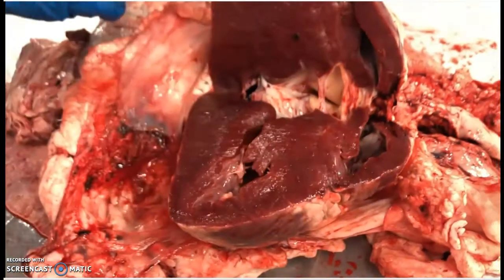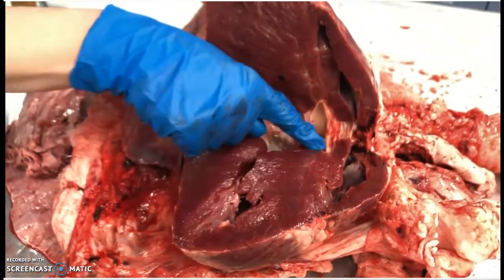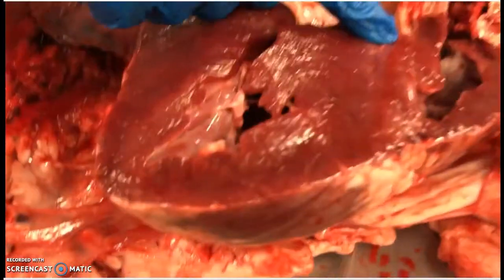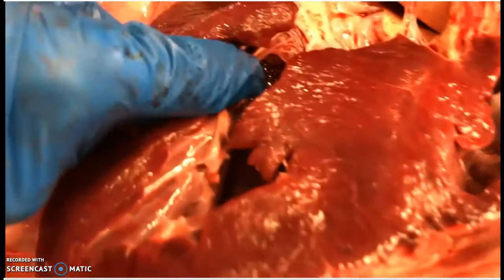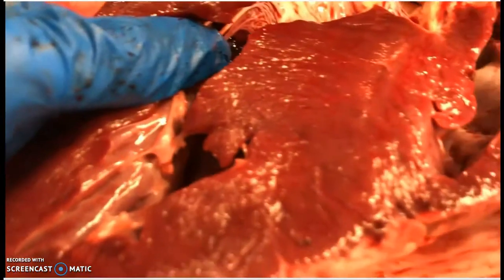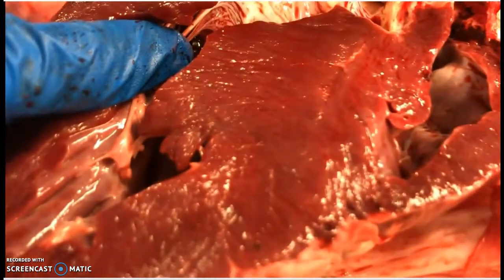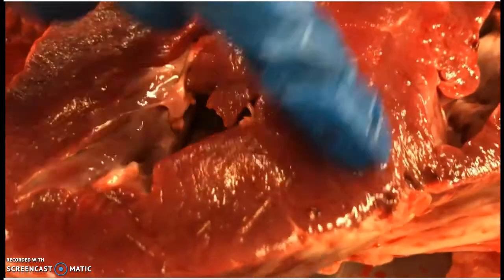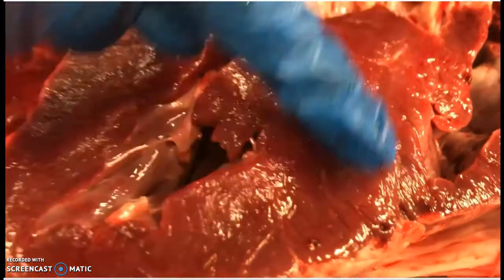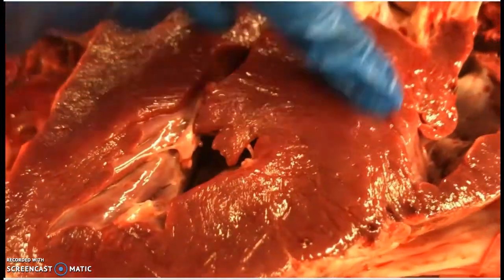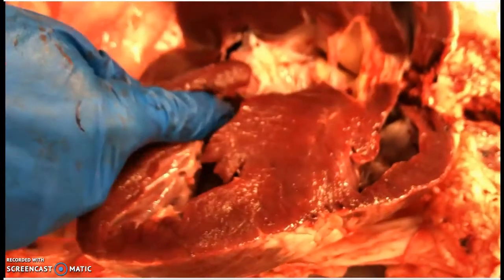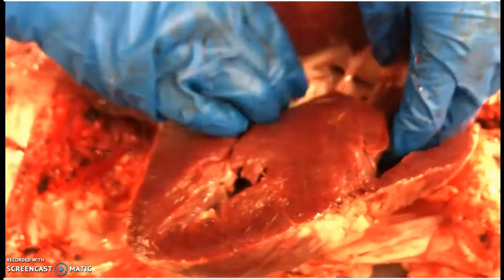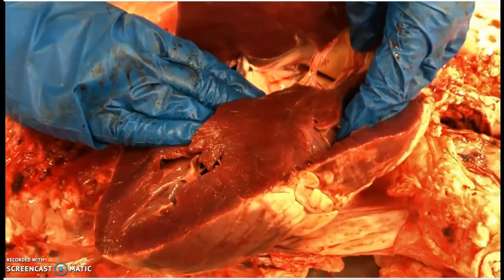Other internal structures: this is the septum. The septum separates your right and your left ventricles. It's a wall between those two chambers.